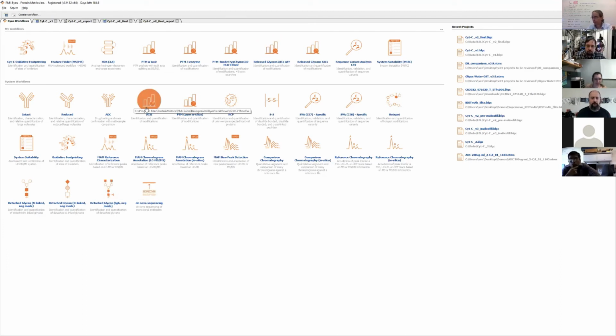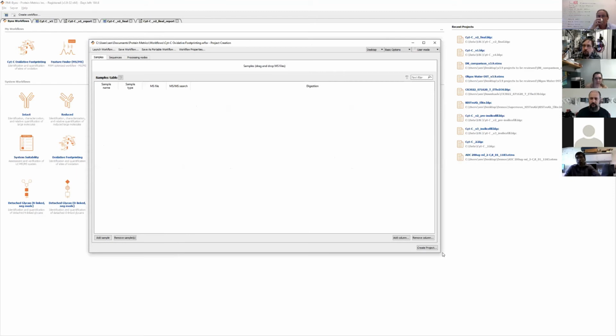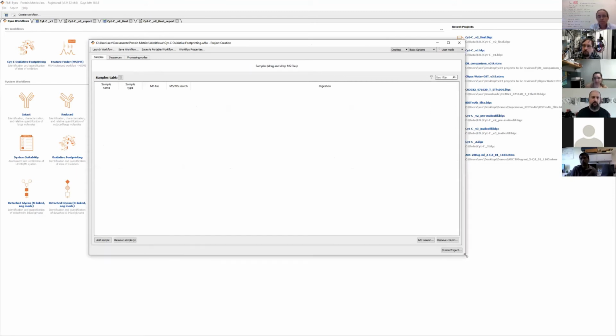So we're going to be looking at the oxidative footprinting workflow, which I have modified and saved a copy, and that's what we distribute to this site, the oxidative footprinting. So let's take a look in there, and then I'm going to talk to you a little bit about what is in here, and then I'll show you how to get it started and what the results will look like.